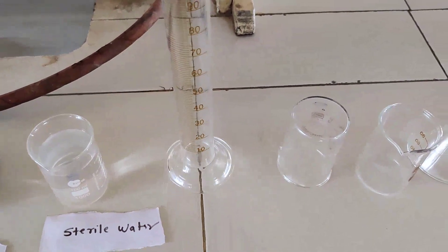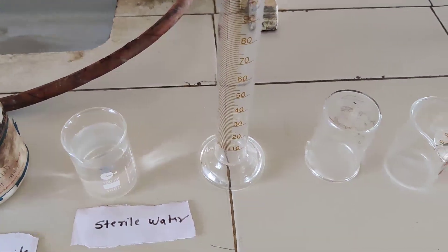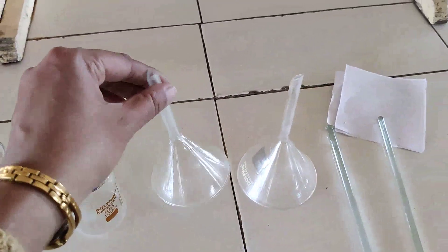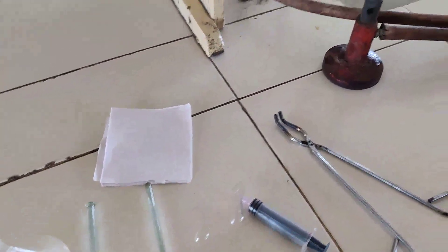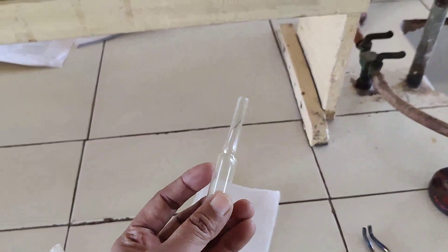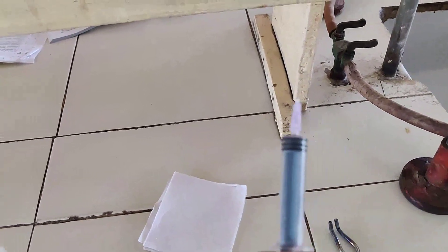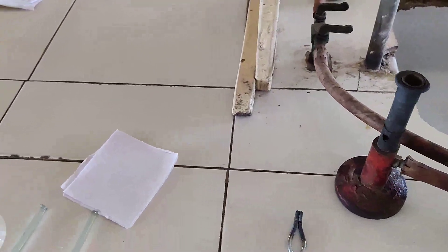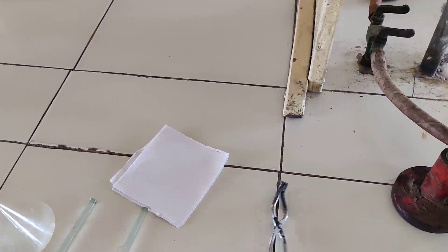Glasswares required for this preparation are: a measuring cylinder, a beaker, and for filtration a funnel is required. Filter paper and glass rod are also required. We have to fill the solution in the ampule with the help of a syringe, and we have to seal the ampule by pulling it with a forcep, which is also called a pair of tongs.